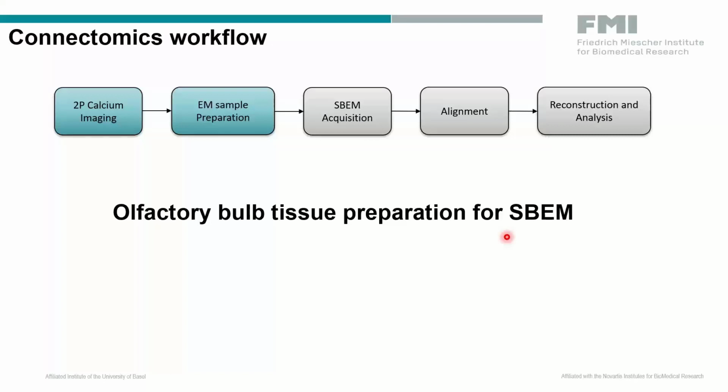Now let me present to you the sample preparation part, which is a very crucial step for serial block face imaging. I would say it's almost the most critical part, or rather the most important part, for being able to image the sample.